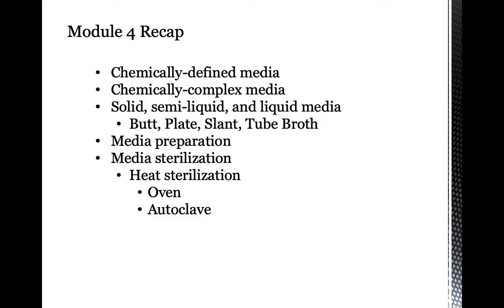So aside from the type of media based on component and based on form, we also made a quick discussion about how you do media preparation. As I discussed during the pre-lab, I mentioned the sequential steps needed in order for you to prepare your culture medium.